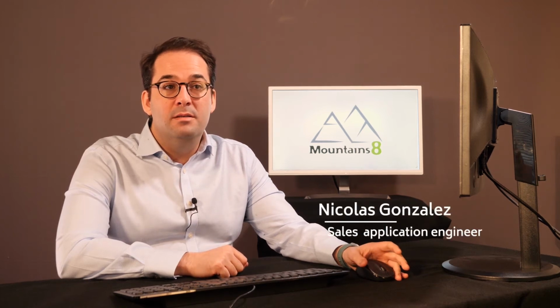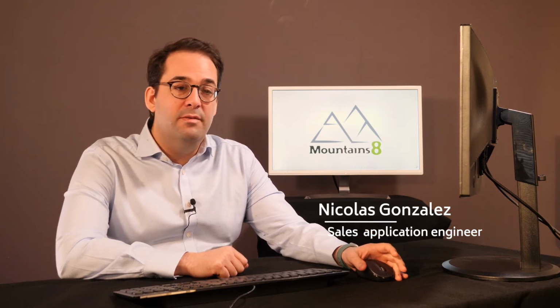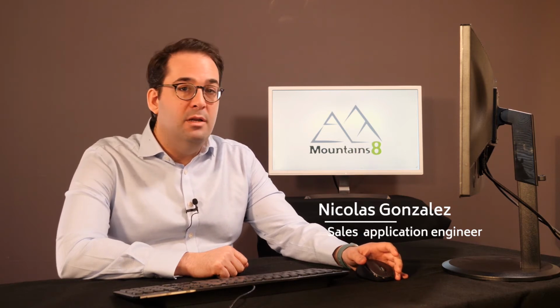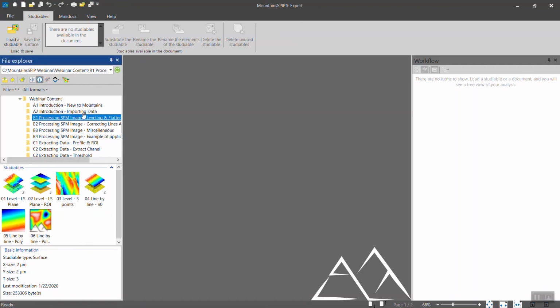After importing your data, usually the first step that one does is correct for any tilt you may have on your surface, flatten your surface, especially when using an AFM, an SPM. So I prepared a couple of data here to walk you through the different choices and features that we have for leveling and flattening the data. So let's start with this one.